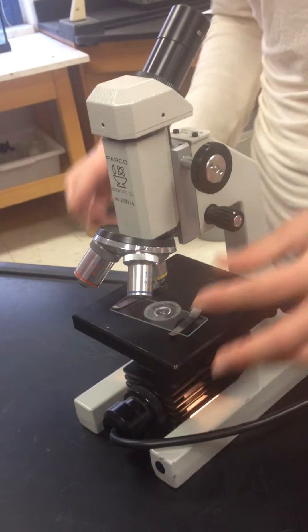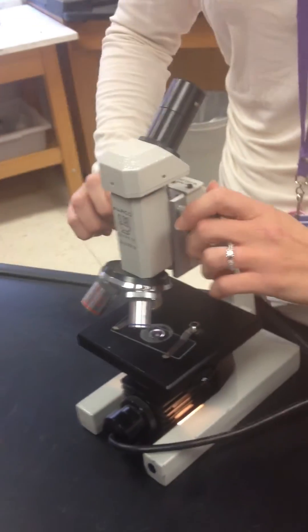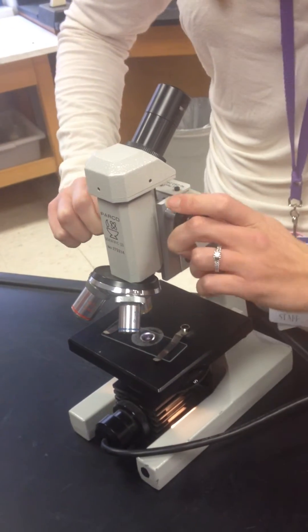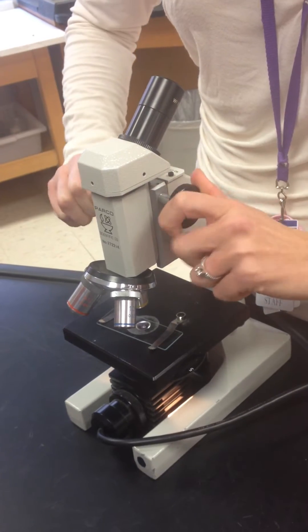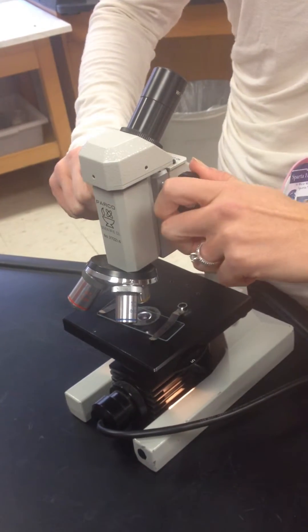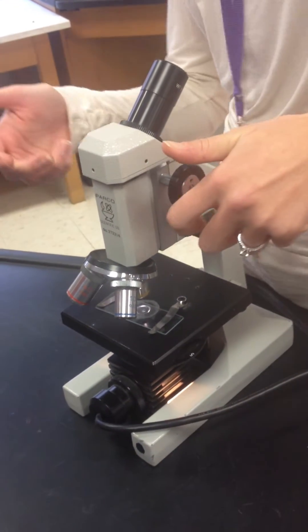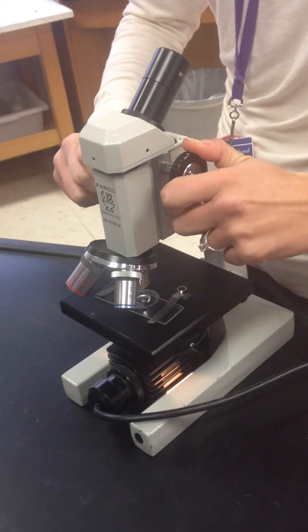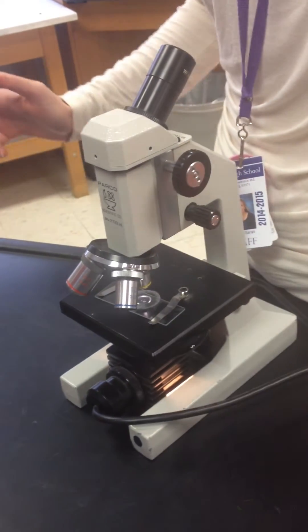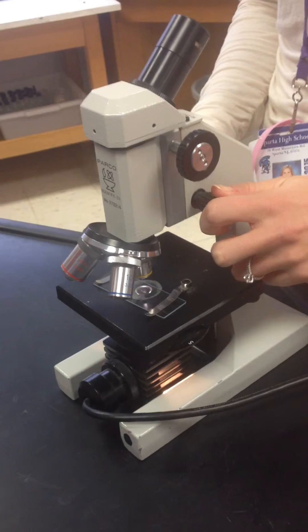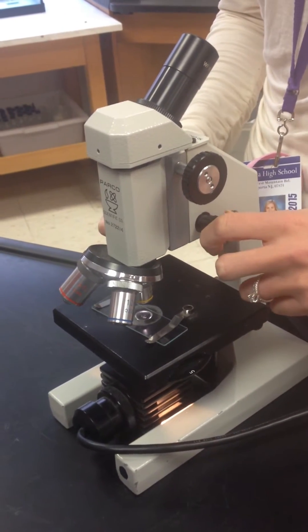You then are going to look through the microscope and focus it using the coarse adjustment knob first. Once it's as good a focus as it can be with the coarse adjustment knob, you're going to take your hands off of the coarse adjustment knob and make those last-minute fine-tuned adjustments with the fine adjustment knob.